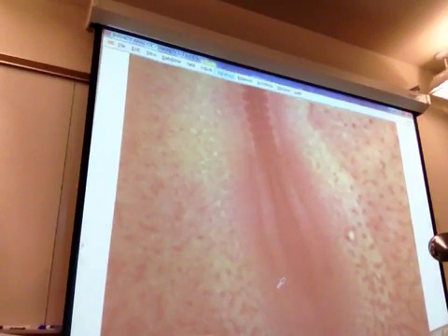So does the notochord disintegrate and turn into the cartilage between your vertebrae, basically, the nucleus pulposus, right? That's kind of a complex question. I can show you that later. But at this point, is this still notochord? For everything we're going to look at, there's still going to be a notochord. There's notochord there. There's neural tube there, both.